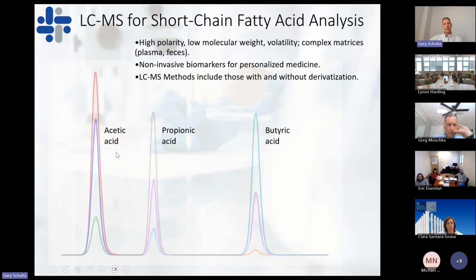For the separation of these short-chain fatty acids by LC-MS, an example is shown here, where the acetic acid peak elutes first, then propionic acid second, and butyric acid third. There are 3 peaks here. The top chromatogram is used for quantifying each of these components, where the other 2 chromatograms from this triple quadrupole measurement are used as qualifier ions to confirm that there are no co-eluting interferences within each of these unique signals for each of these 3 analytes.